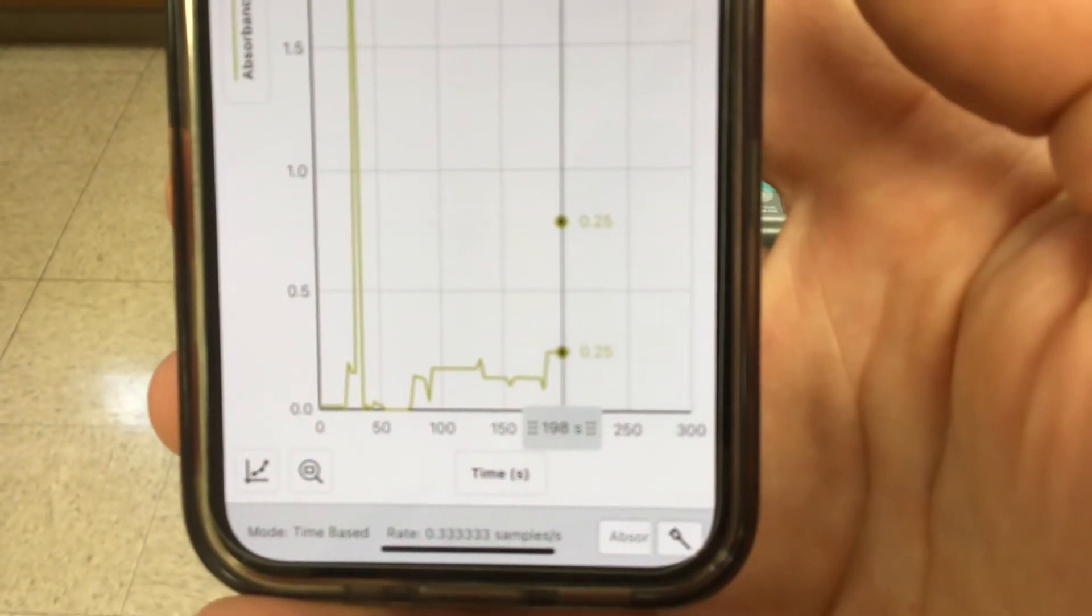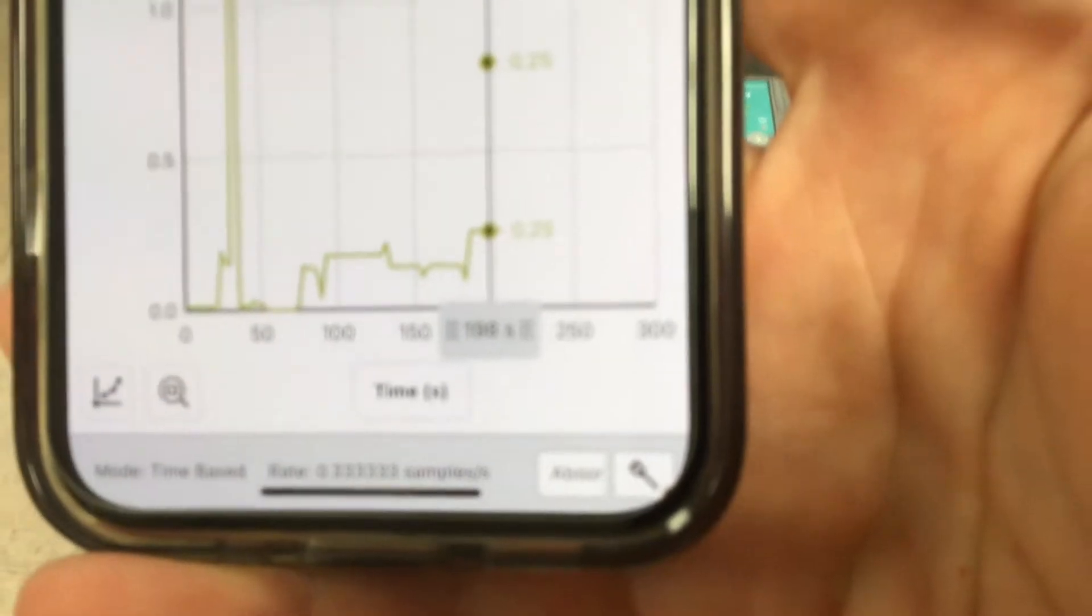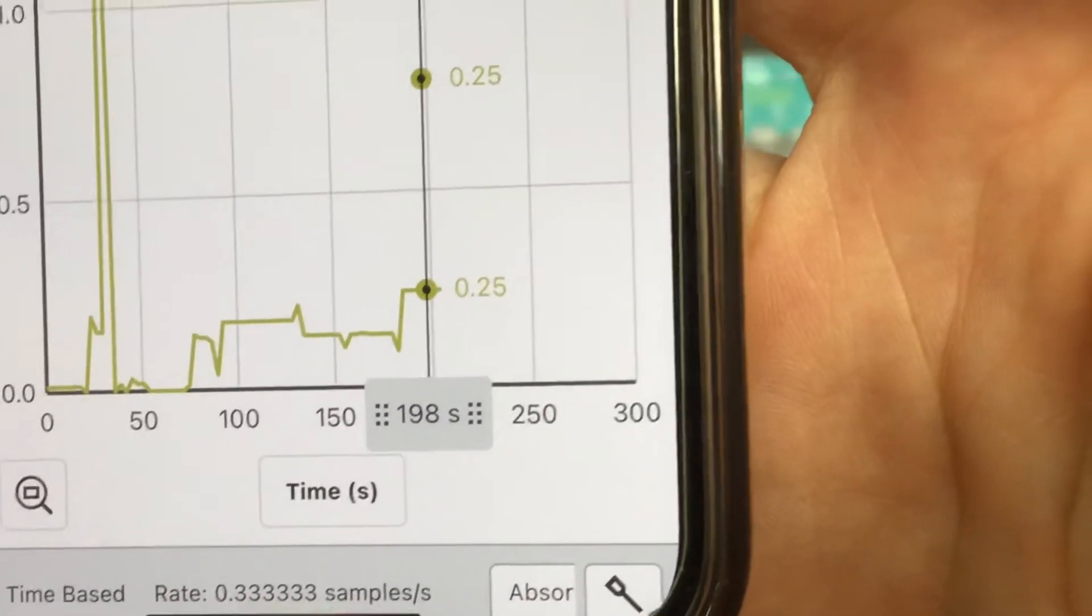All right. So what we've done, and you'll see this when you look at the write-up, the iron concentration is not changing. The Fe^3+ is the same, but the thiocyanate is getting progressively more concentrated in this one. We're good.